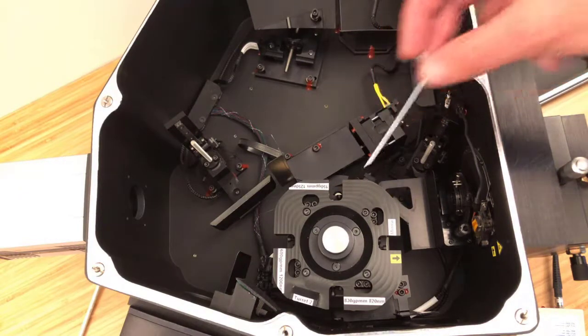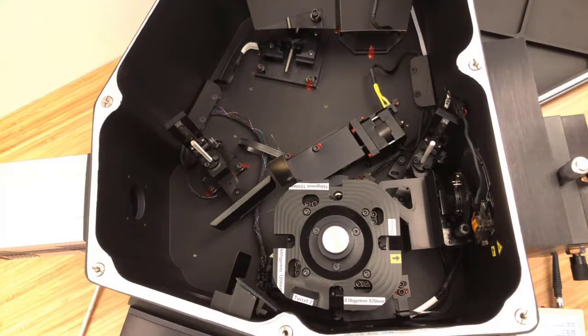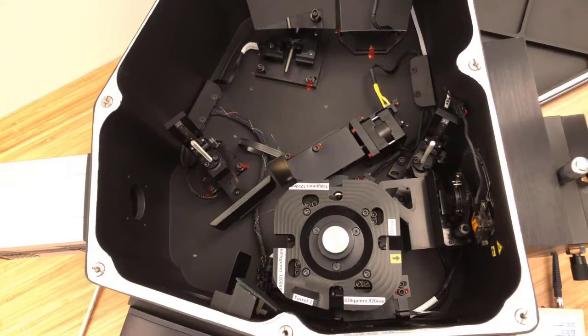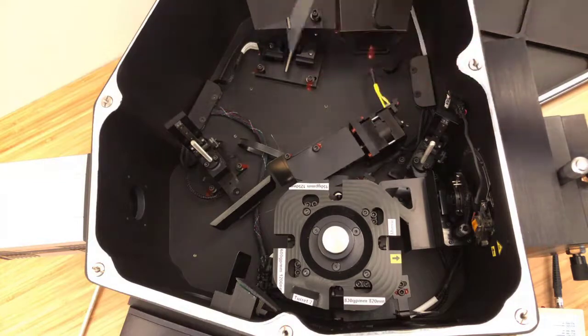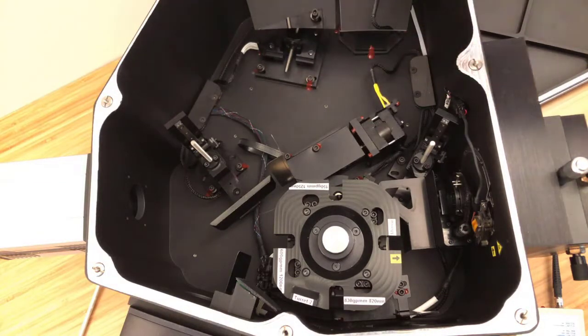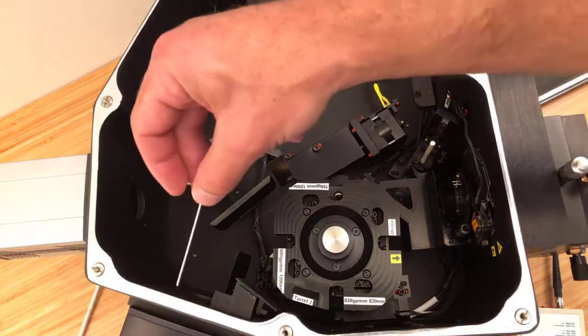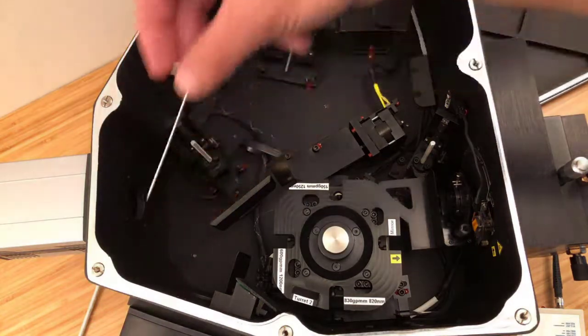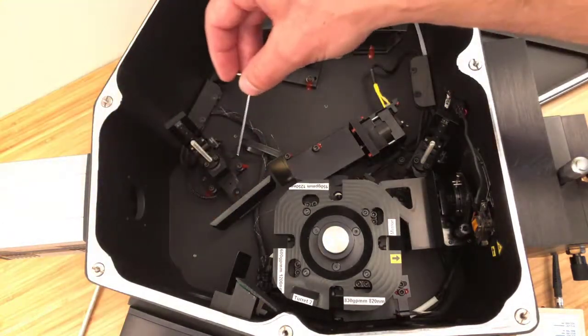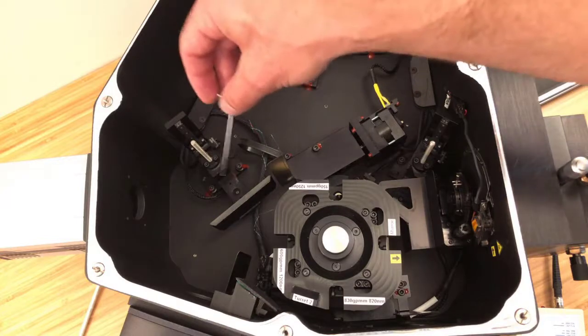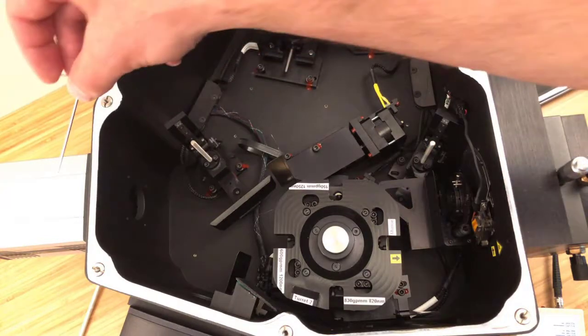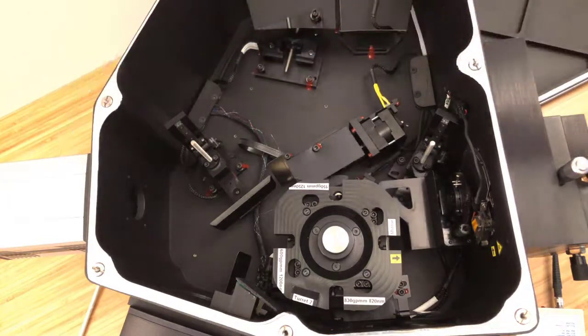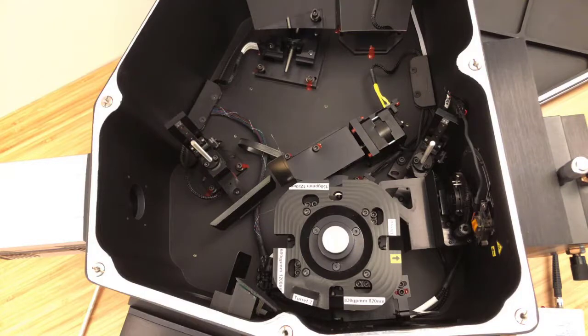Here, the different wavelengths of light bounce off at different angles. So they bounce off here, hit the focusing mirror, and then those different wavelengths are brought to focus either here on the direct port, or when this second linear translation stage mounted turning mirror comes up, they'd go to the side port. And again, that's a motorized and computer controllable turning mirror.